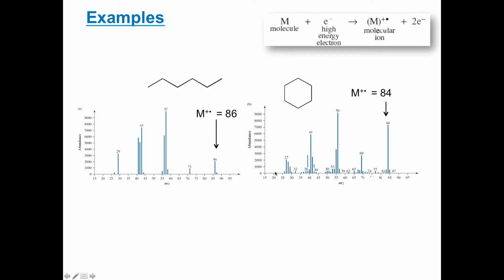So there's a few other things to note with these two mass spectra. First of all, there's a bunch of other signals here at lower mass values. And that's because under the extreme conditions of electron bombardment, often the molecule will actually break up into fragments. And so you can see those lower molecular weight fragments appearing also. So that's why the one on the right-hand side is the most interesting one, because that's the occasion where the molecule survives intact through to the mass analyzer. So the fragmentation pattern is one thing to note.